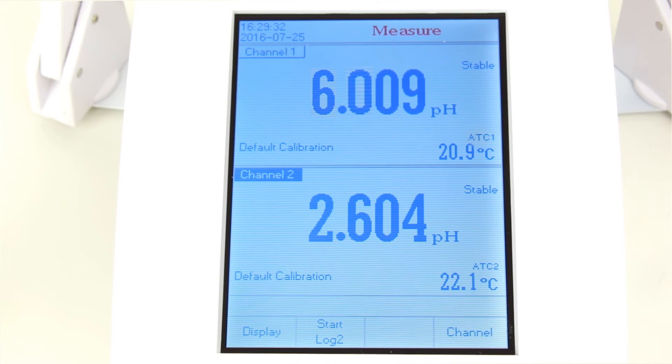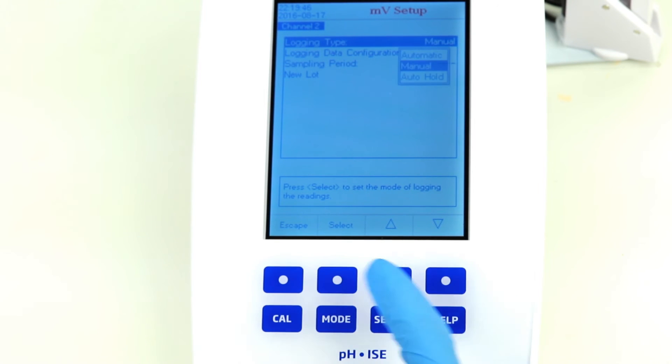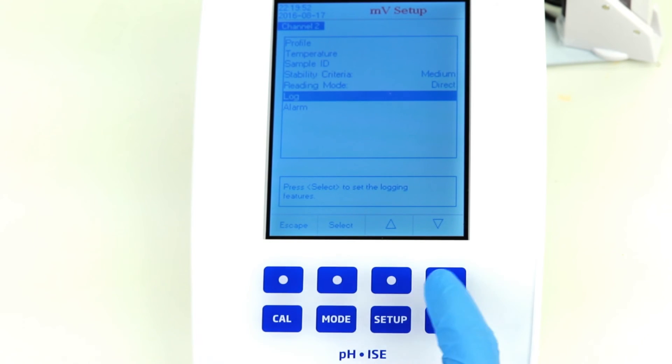Logging on the HANA HI5222 dual-channel benchtop meter is fully customizable, with three different logging modes: automatic, log on demand, and auto-hold logging. Auto-hold logging records the measured value once stable, which ensures that logs are never taken before the electrode is stable.